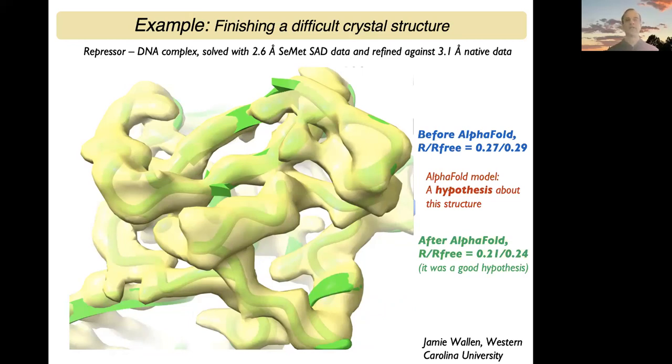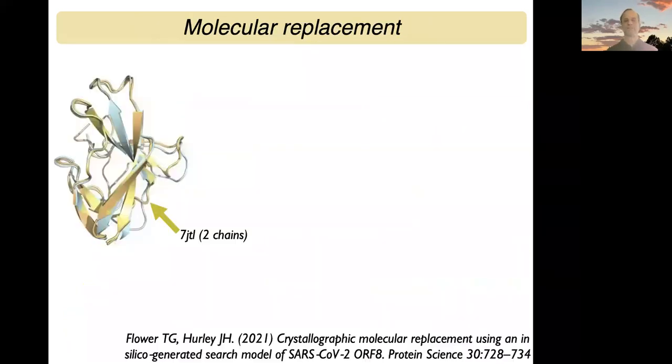All right, so what about molecular replacement? That's the other big technique in crystallography. Well, Tom Flower and Jim Hurley wrote a paper earlier last year on this. And here's a summary of their work.